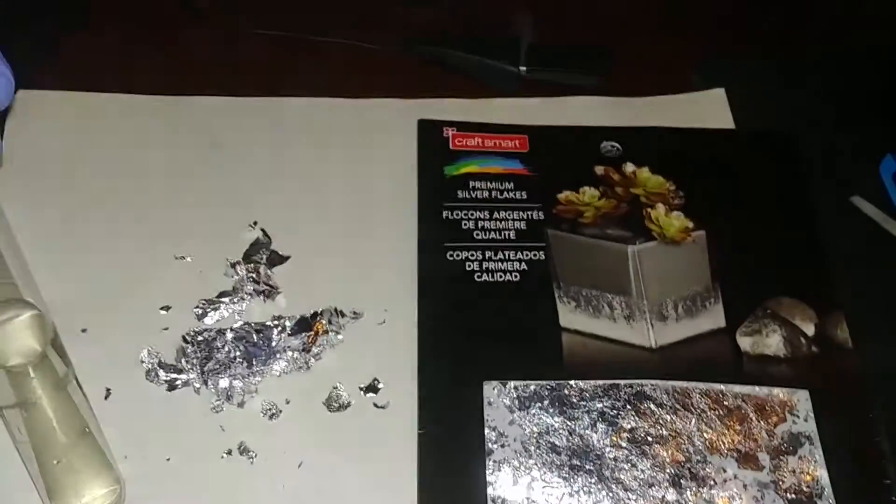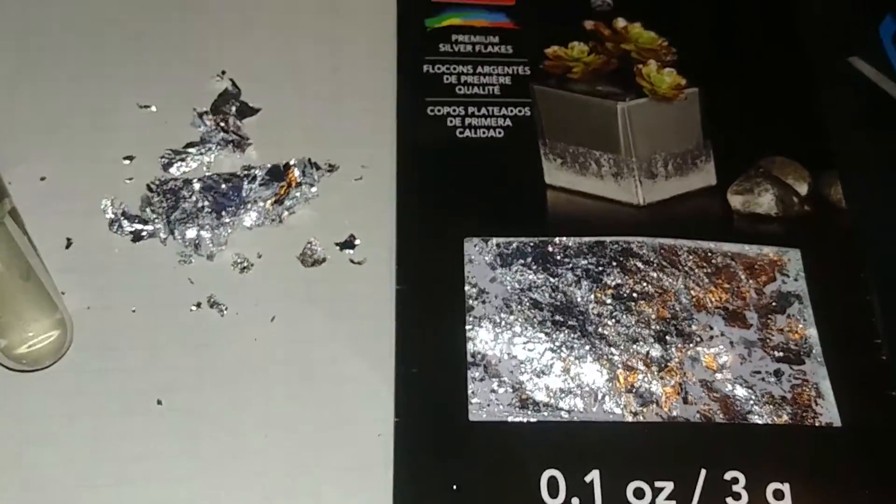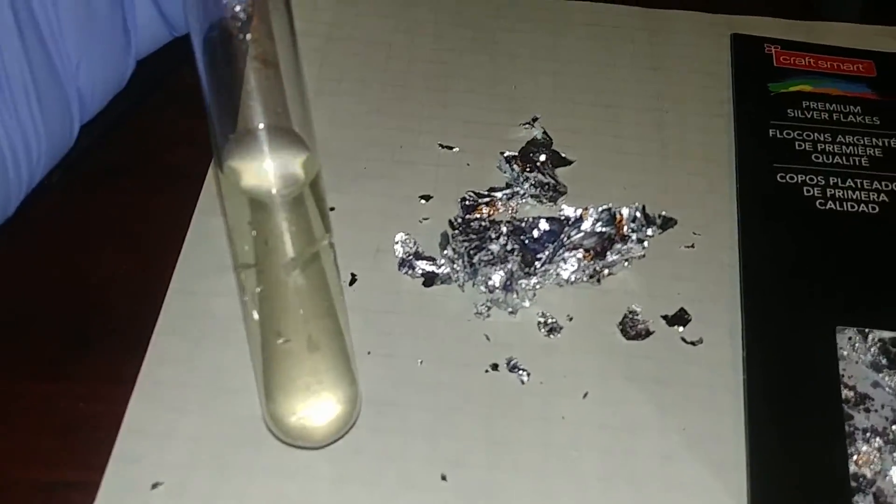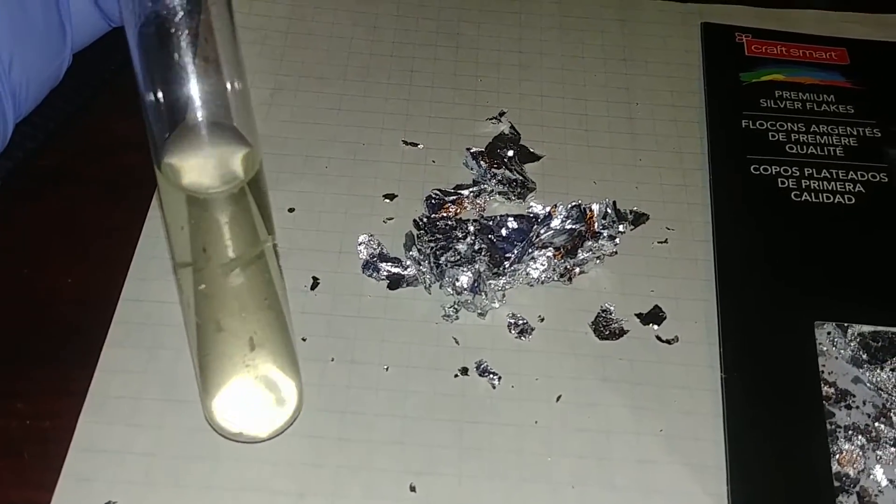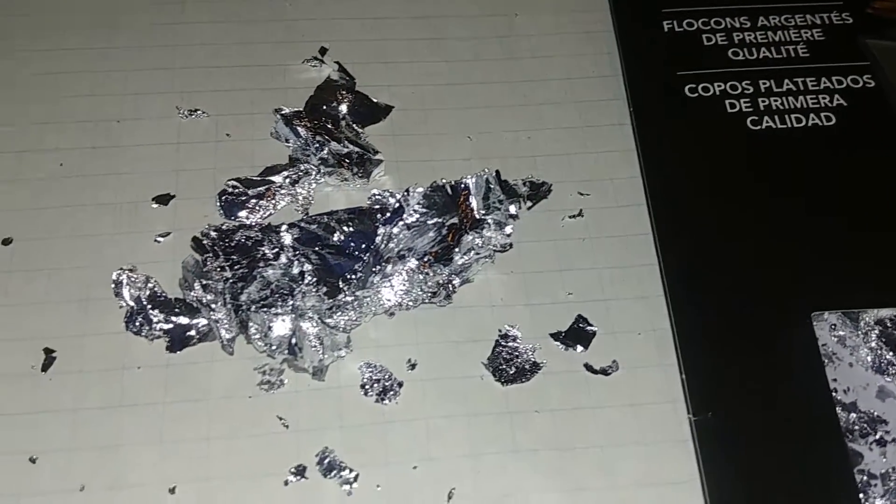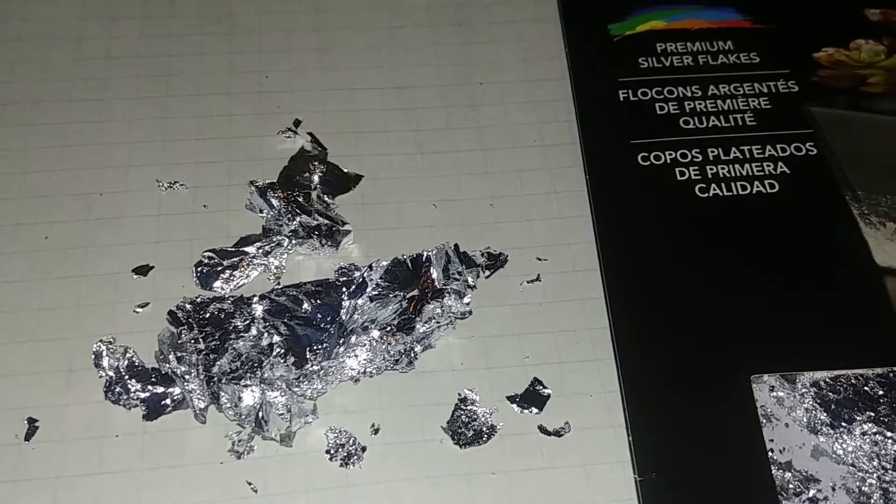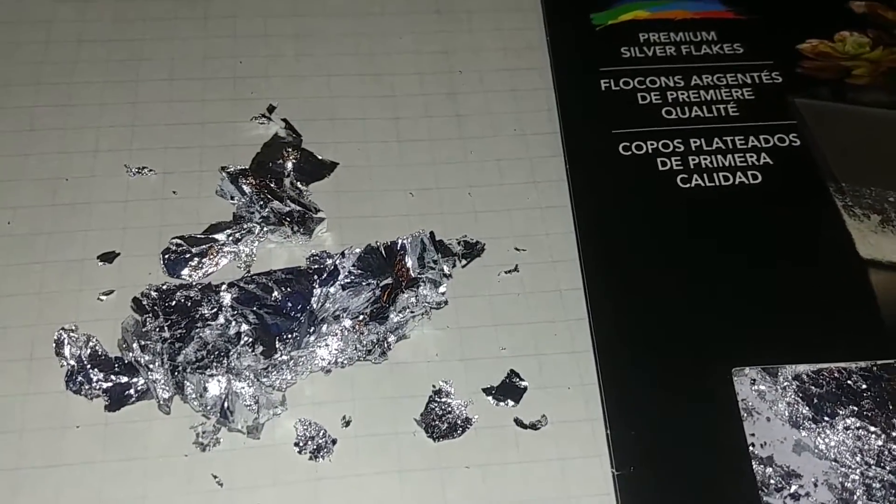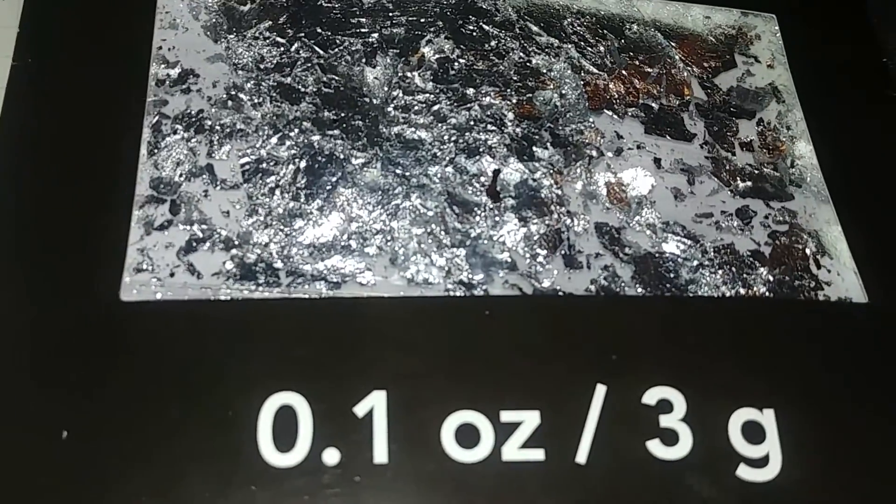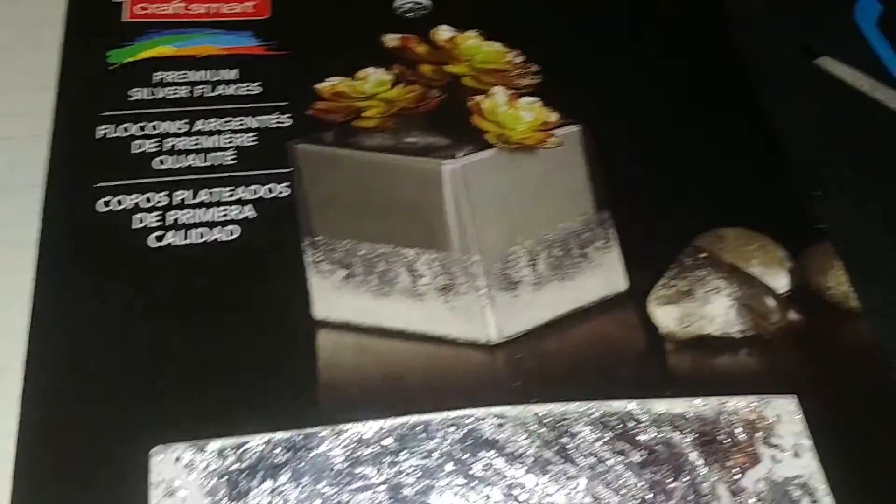I'm using silver leaf from the craft store. This is 99.9% pure silver. And I'm using my nitric acid that I made the other day. Yesterday I put in this amount here. I did not measure it out. This stuff is super thin, it gets blown away so easily. It's not very much at all. The whole package is 0.1 ounce or 3 grams in total.